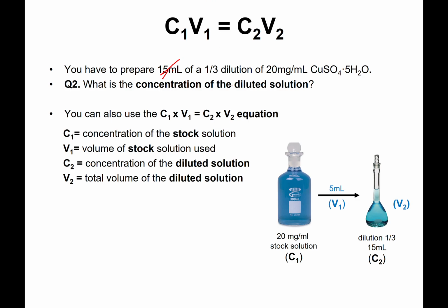And what you use is what the dilution factor means. If you remember, I said before, this means 1 milliliter of stock for 3 milliliters of dilution, right? So you can just plug in 1 milliliter here and 3 milliliters here. And then you can use all the other information. So once you have the dilution factor, the total volume of the dilution is basically irrelevant to resolve anything here with this formula.